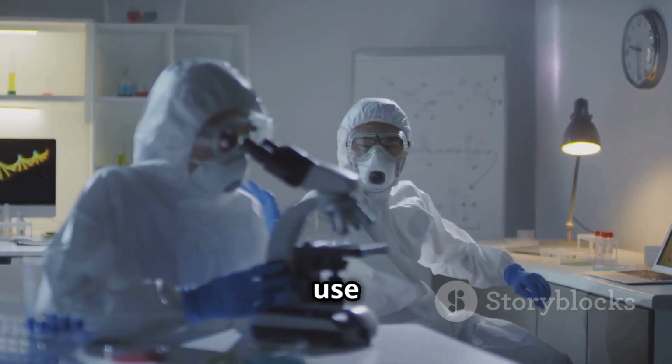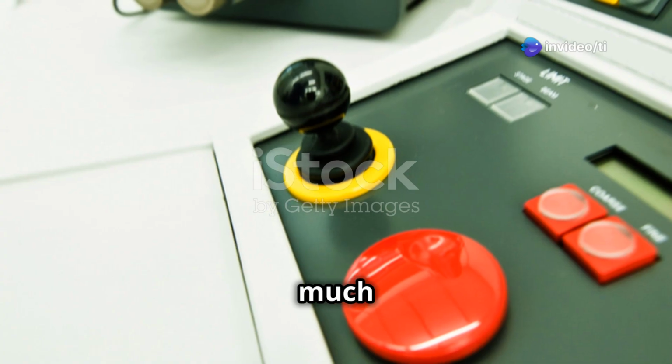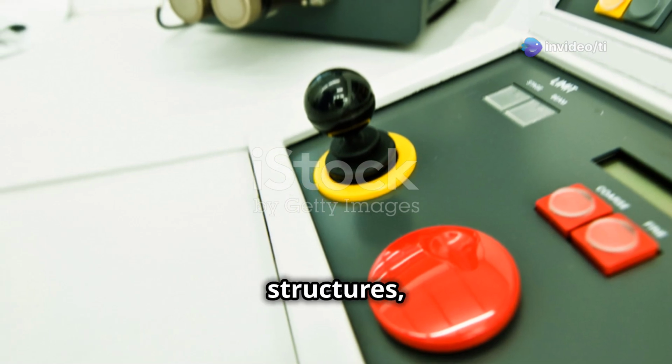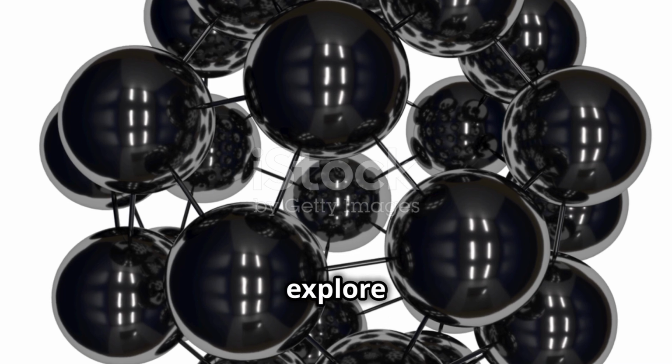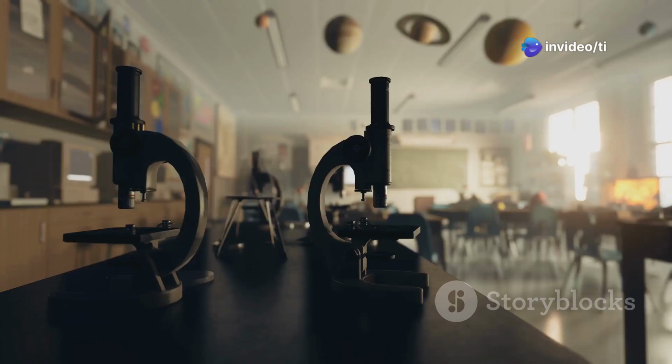Electron microscopes use a beam of electrons instead of light to illuminate specimens. This allows for much higher magnifications and reveals incredible details of even smaller structures, like viruses or individual atoms. Scanning probe microscopes explore surfaces at the atomic level, providing detailed topographical maps.